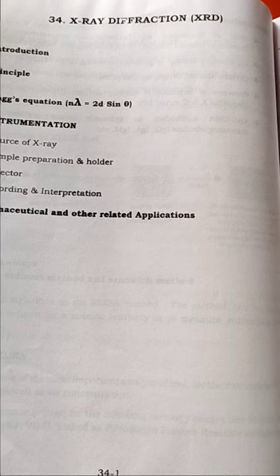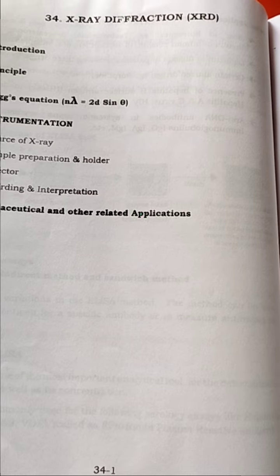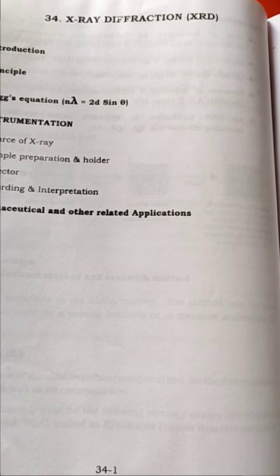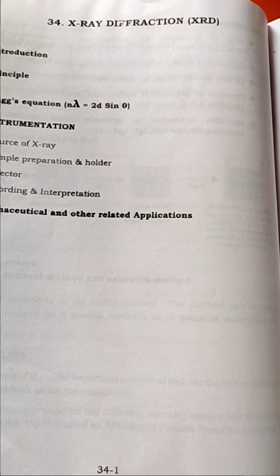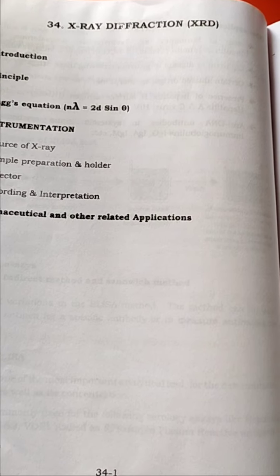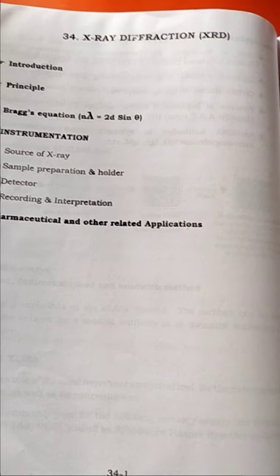The atoms are arranged in a plane with a particular distance, for example x, y, z. When X-rays of wavelength similar to the interplanar distance fall on the atoms, they diffract due to constructive interference. The recorded photographic film patterns are measured using X-ray detectors. Interpretation of the pattern gives information on various aspects of the compound.